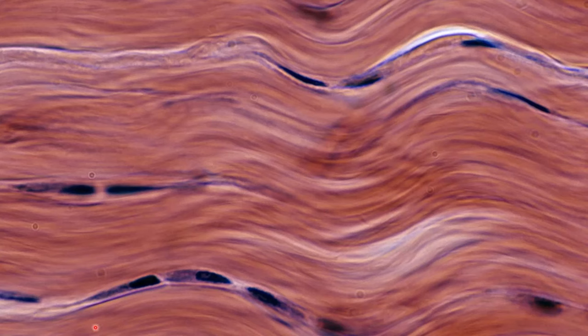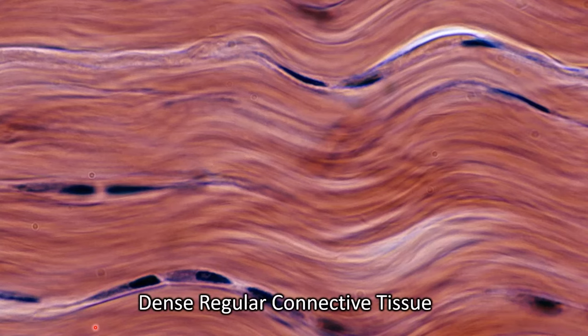This is another example of dense regular connective tissue. Here, it is easier to see that these cells are located in between the non-living fibers, but you can also see what I was talking about with the rows lined up end to end.